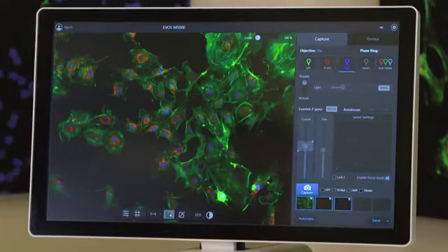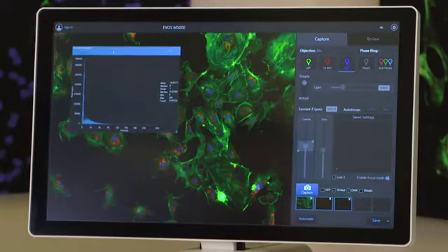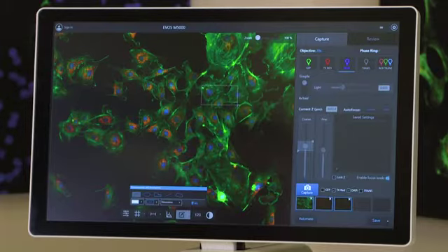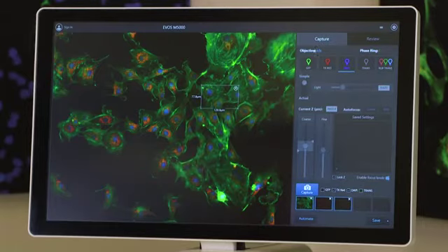We also have the capability of showing a histogram of the intensity distribution here for the channel. There's the capability of going in and doing annotations, so you can select a tool here and measure an area within a rectangle. It gives you a calibrated area here. This is because the calibration of the system is automatically detected and known based off of the objective that it's using.